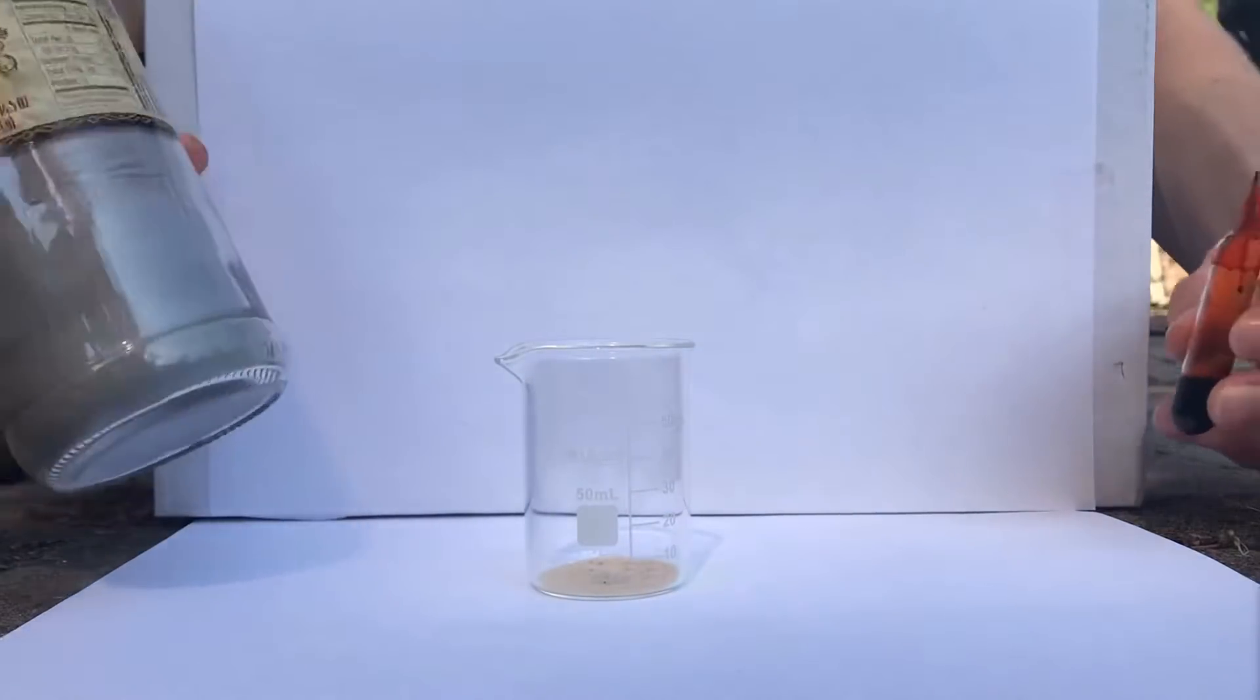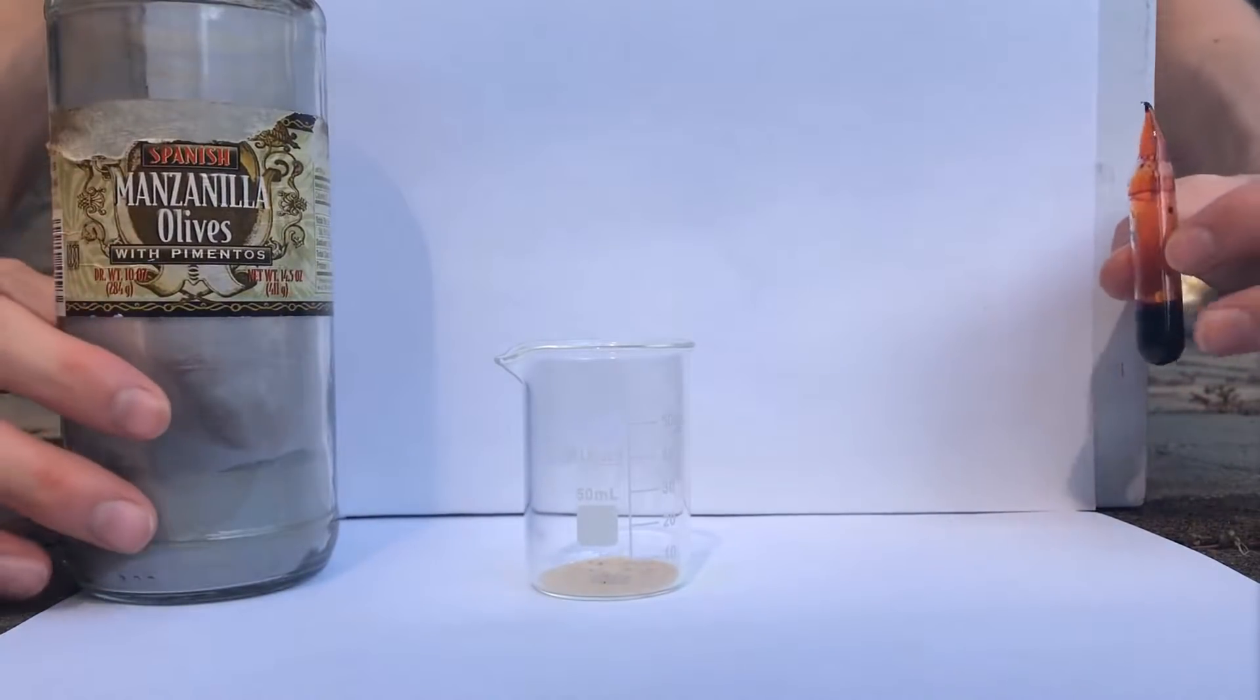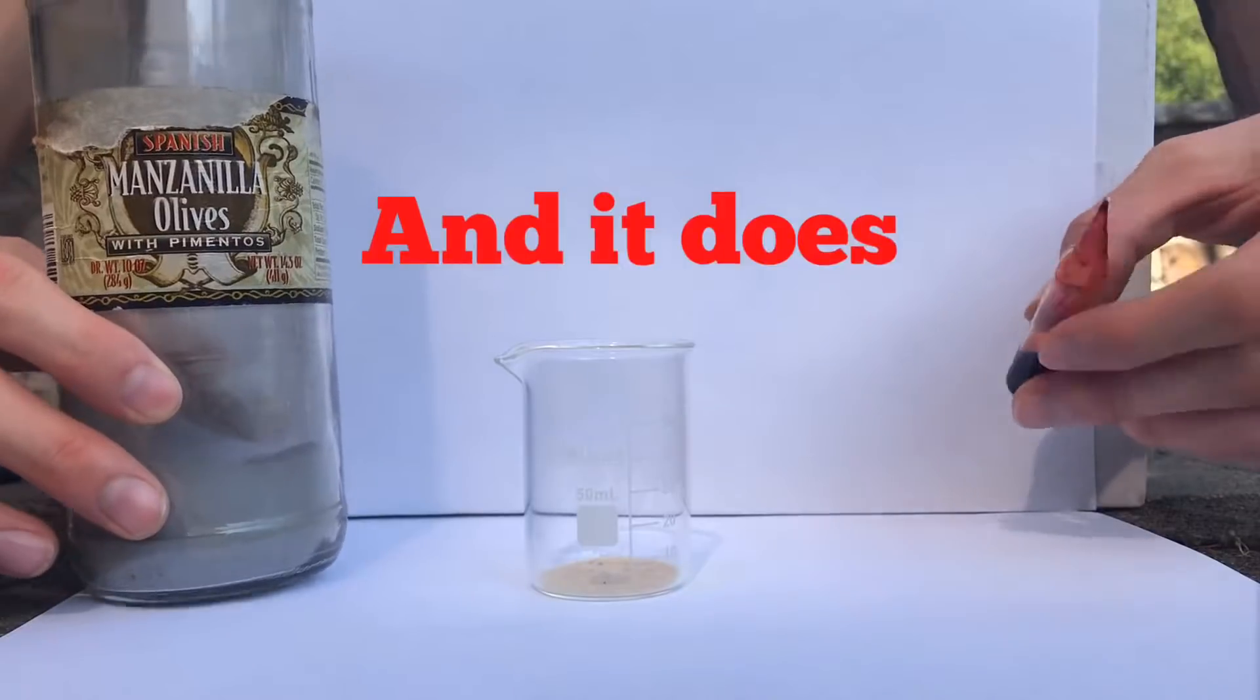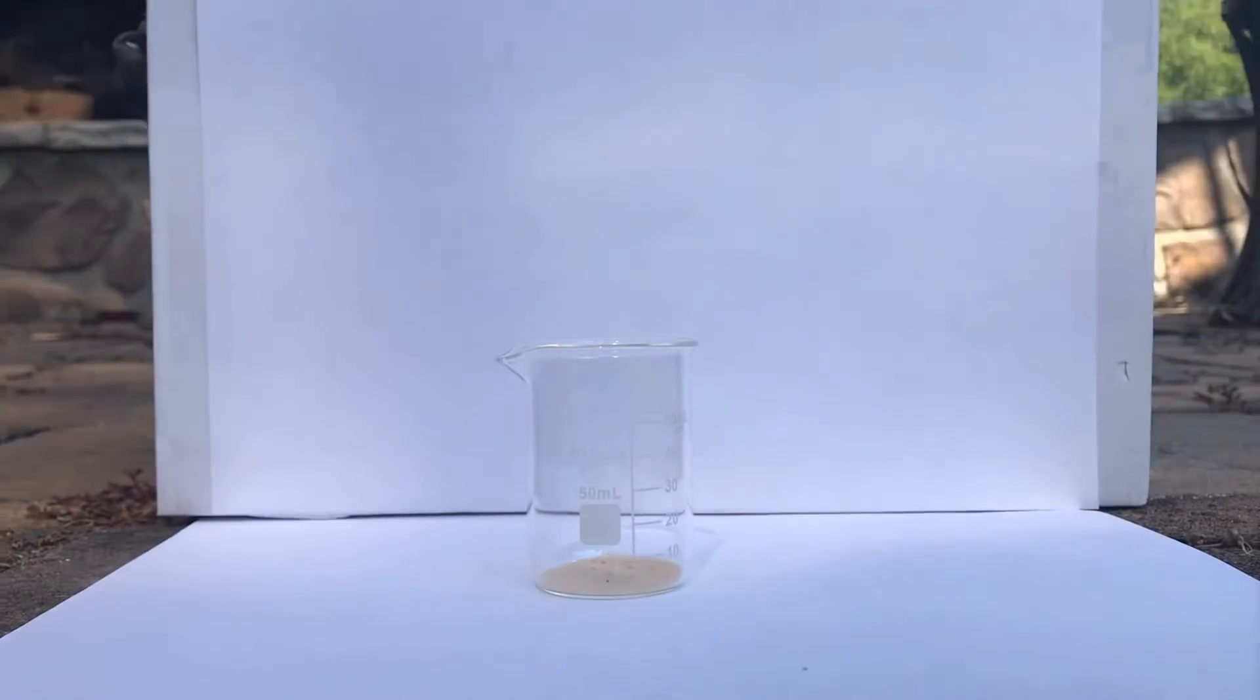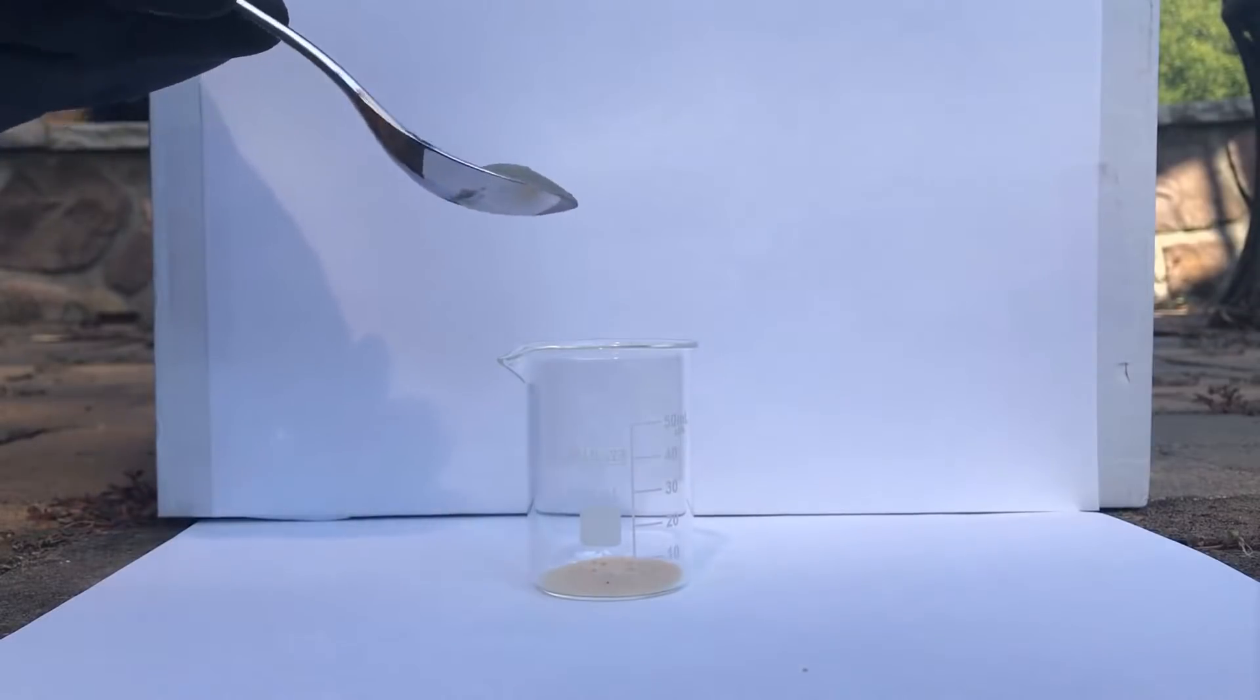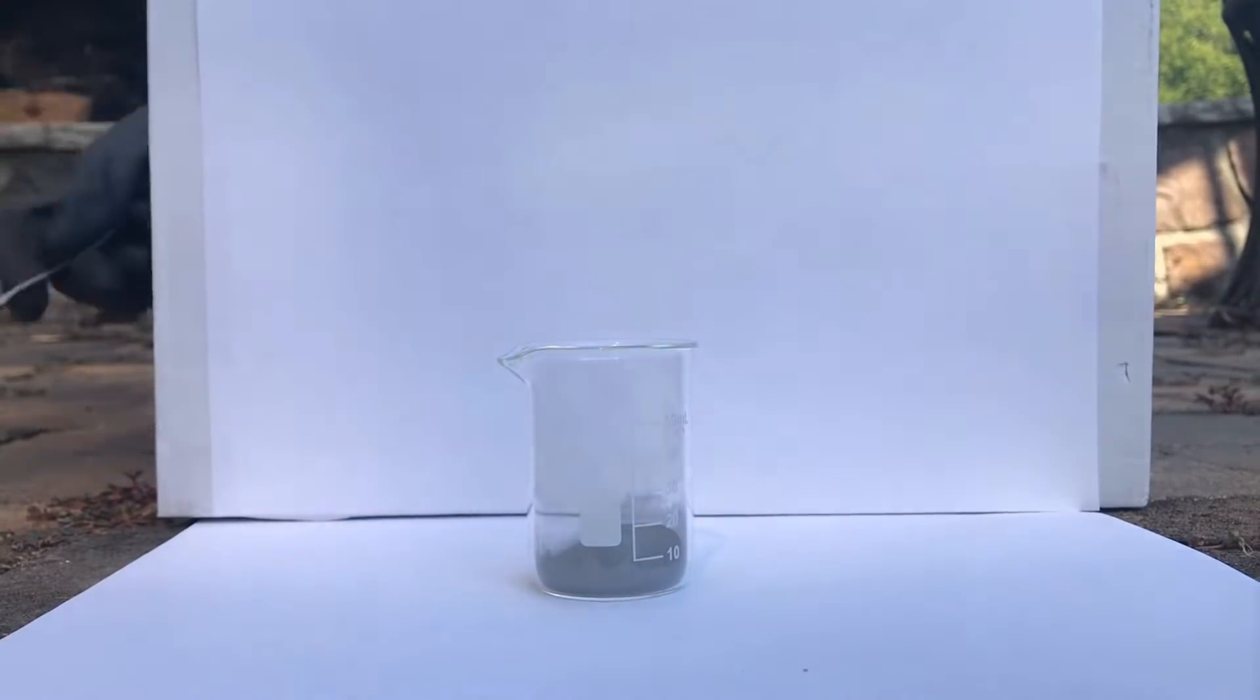Okay so now instead of aluminum foil we're going to do aluminum powder as it has a lot more surface area, it should react very quickly. And bromine obviously first goes in the aluminum. Three, two, one.